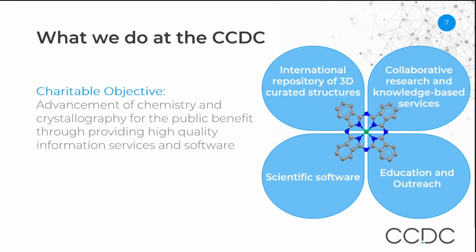All of our tutors today are from the Cambridge Crystallographic Data Centre, or CCDC for short. CCDC is a non-profit organisation. It was set up to advance chemistry and crystallography for the public benefit. One of the primary ways we do that is to curate and distribute the Cambridge Structural Database, or CSD for short. Alongside the database, we provide scientific software, enabling you to discover more from the data. We conduct cutting-edge collaborative research to help advance structural science, and we do education and outreach activities, designed to help inspire and train the next generation of researchers.